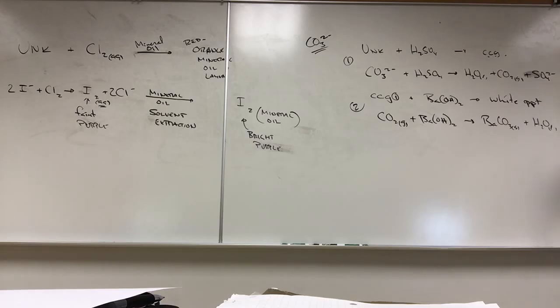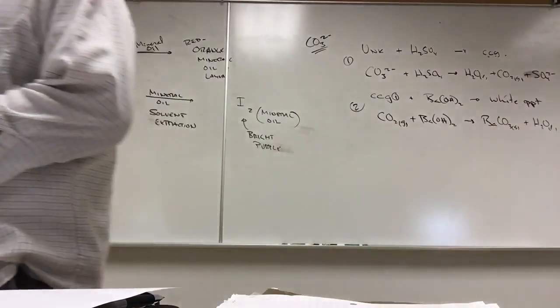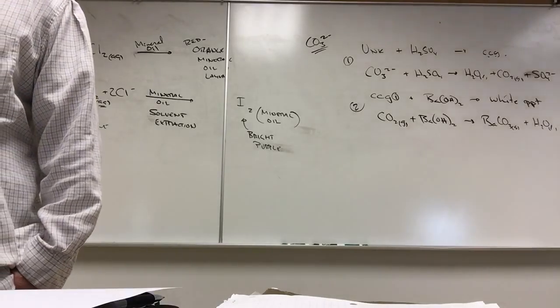But the problem is if you hold that in the lab and just exhale on it, you're going to see the same thing, right? Or if you hold it and you don't exhale, you'll still see it. It'll just take longer to develop because there's CO2 present naturally in air. And so we have to be careful that we just let the gas that's being generated here hit that, and we want to see it rapidly develop. That would be a positive test for carbonate.